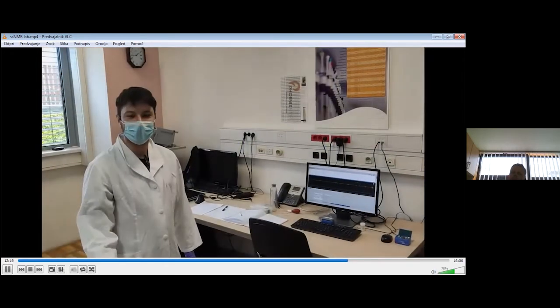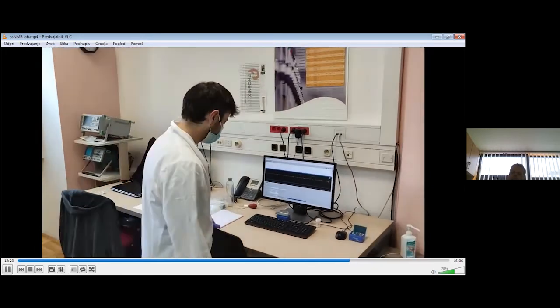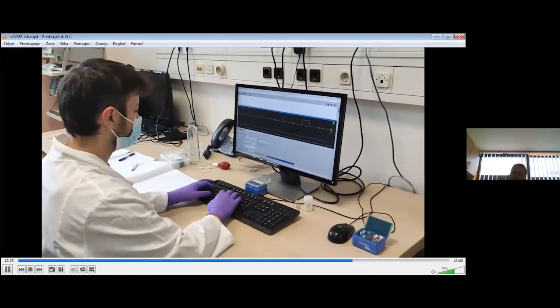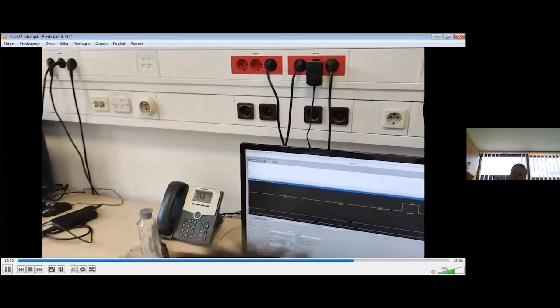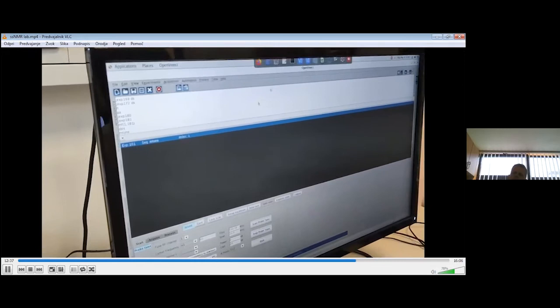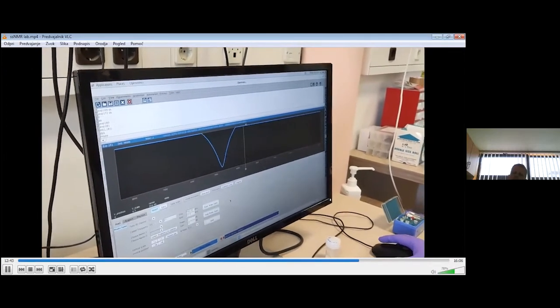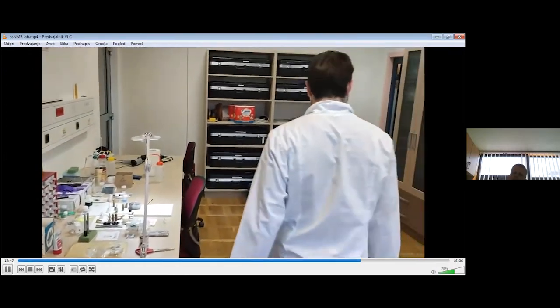Now that our spin is stable at 20 kilohertz, we can measure our first spectrum. But before we can actually do the experiment, we have to tune the probe to the Larmor frequency of the nuclei that we're going to excite. And this is done right below the magnet.